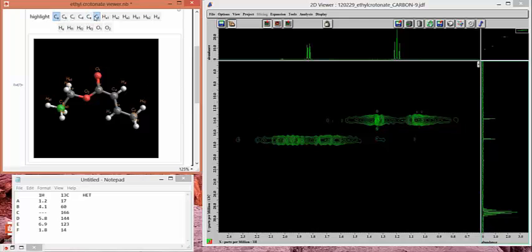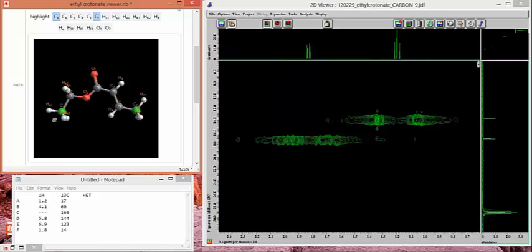Now, if we take a look at the molecule here, in the previous example, we learned that CH3 saturated carbons typically show up in the region of around 10 to 50 parts per million, and the spectra are influenced by electronegativity effects. Originally what I had said was that the carbon A, since it is close to the oxygen here, would be affected by a downfield shift due to the oxygen, and therefore carbon A would be the peak that shows up at 17. However, the heteronuclear correlation spectroscopy tells us that this is not the case. The triplet clearly is this part of the molecule, and the cross peak here shows us that this peak is actually 14 parts per million.